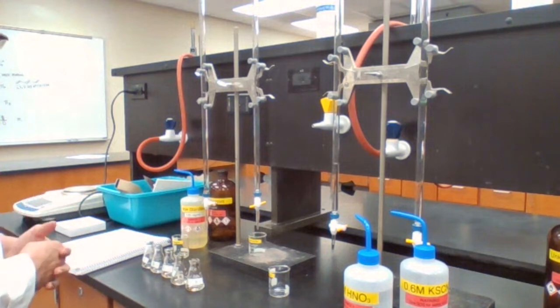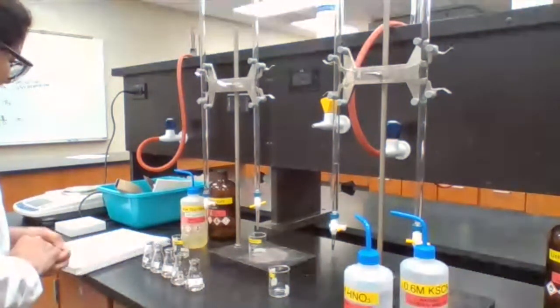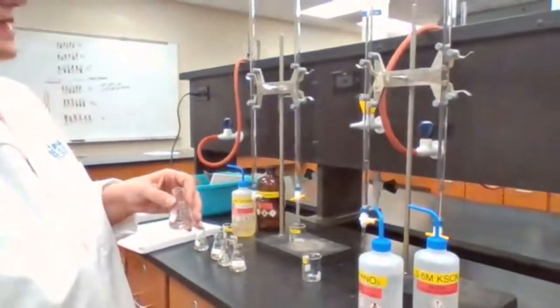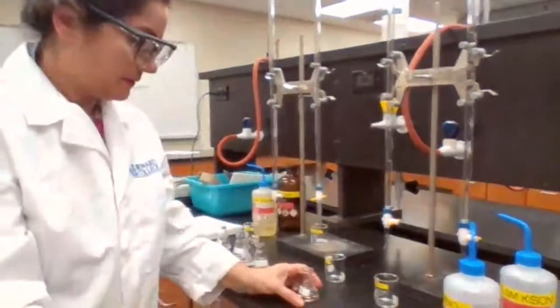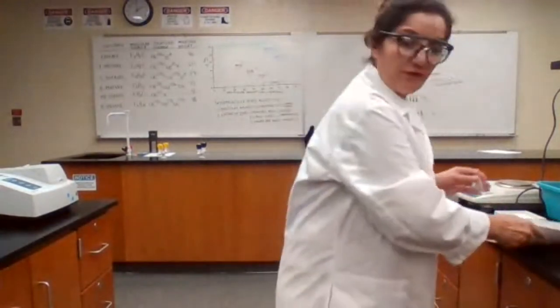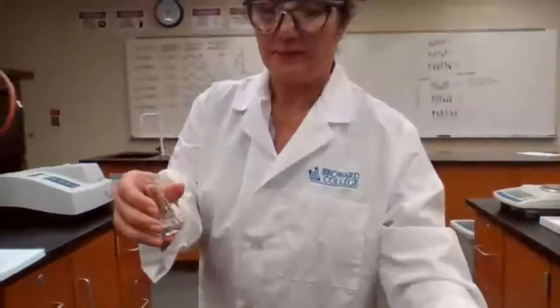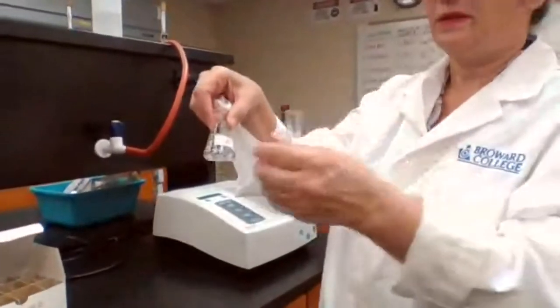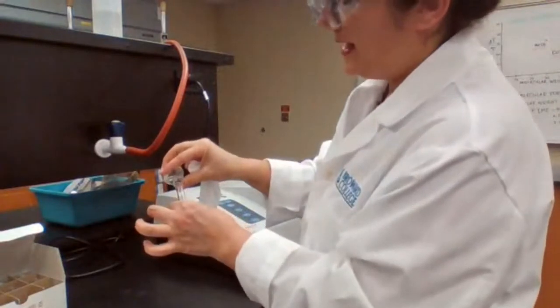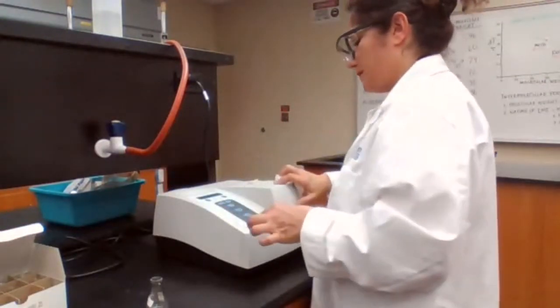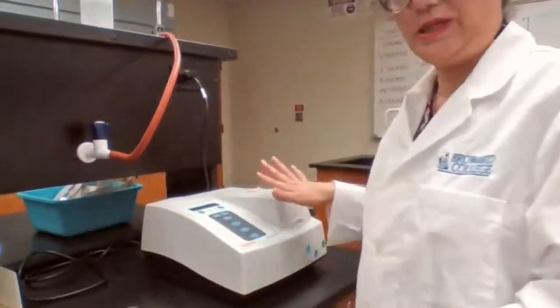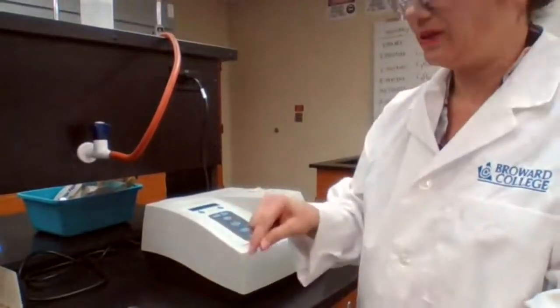KSCN is not being added yet because as soon as we add it we have to start the five-minute timer. Going to add KSCN now — five milliliters — at 1:57. We have five minutes for flask B to be ready. Setting a timer for five minutes. While waiting, we are going to work with sample A: filling the cuvette with solution A.